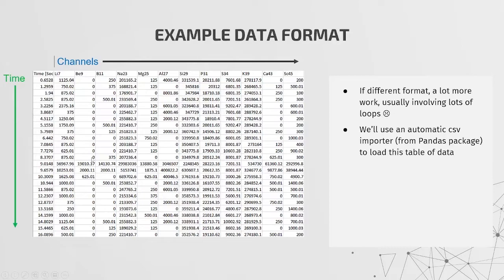So this would be a good example. Even though we're writing an importer for Iolite, you'll be able to use these skills for other tasks outside Iolite. In particular, we'll be using the Pandas function read_csv, and I'll put a link in the notes for this week, linking to the documentation for this function.